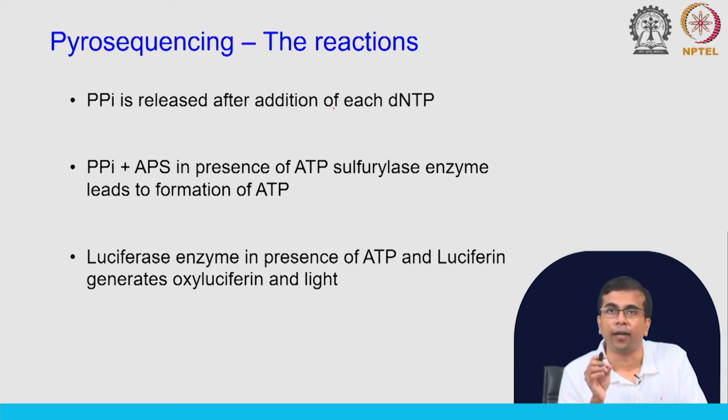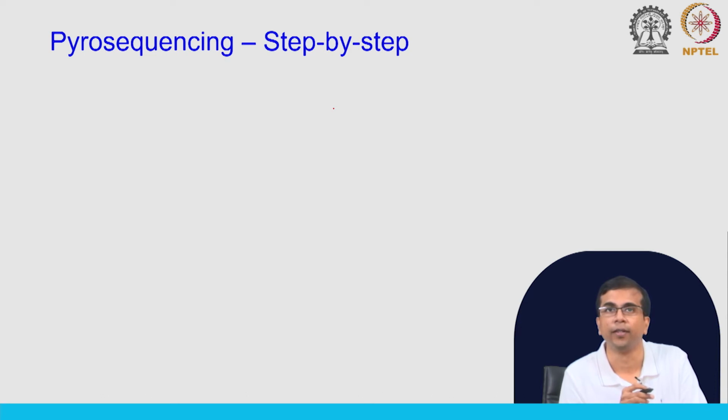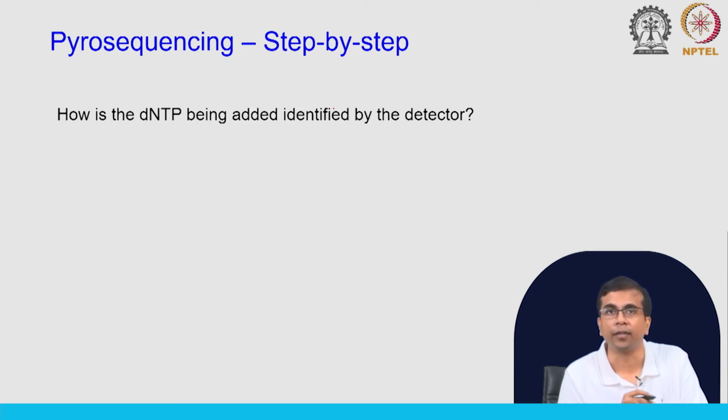Okay. Now, this is the principle, and the detection happens by the light signal that is emitted because of all these reactions that are happening inside these wells. And you have a detector that detects this light. Okay. So, step by step, let us look at this.